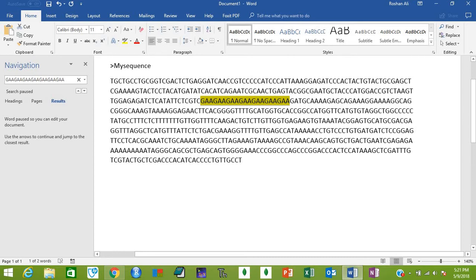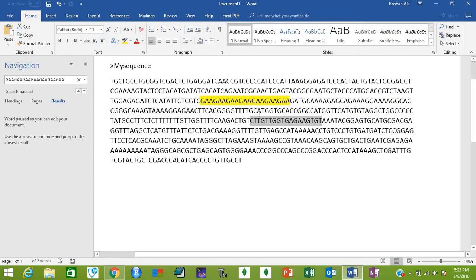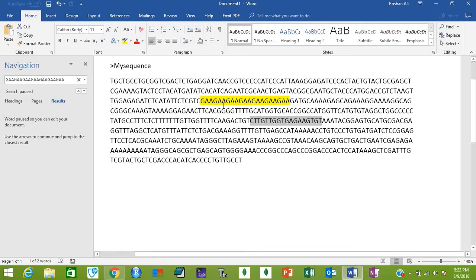One of the primers should be before this SSR and another should be after this SSR. Batch Primer 3 can even find this SSR for you if you don't know where your SSR is, and then design the primers for that as well.